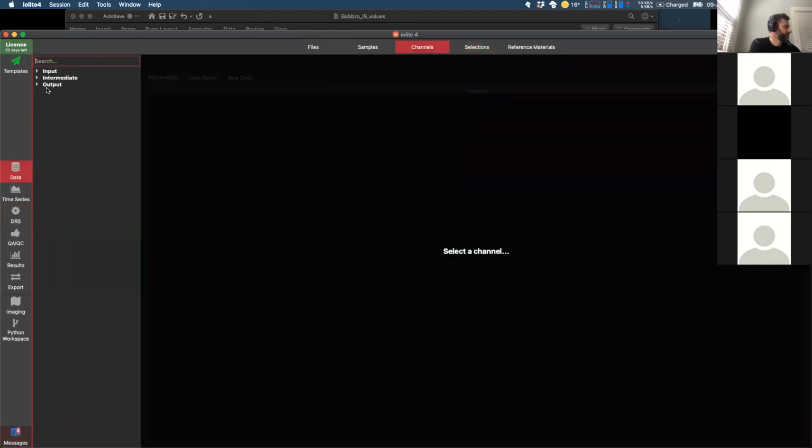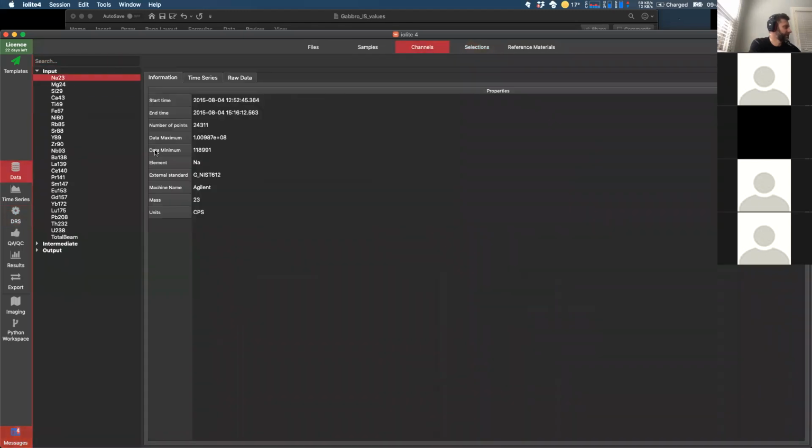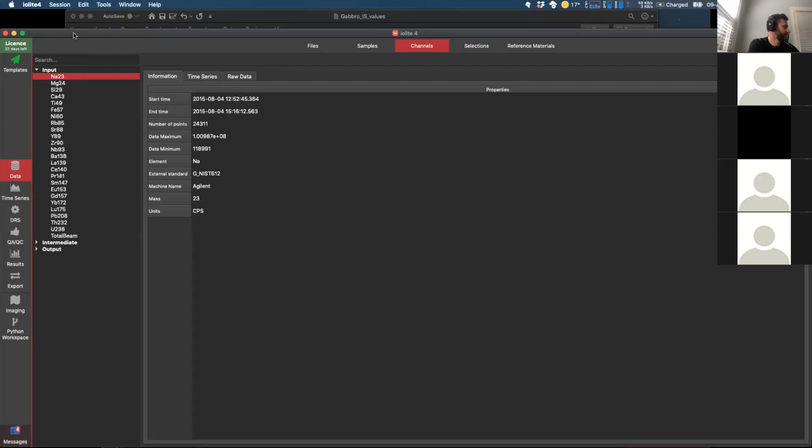So if you go to your channels and look at your input channels, at this one here, we don't have any dwell times because this was imported from a basic Agilent file. But Joe has already added a new tool that will be available in the next release in the tools menu that has a way to set your dwell times in here. So that'll be in the next release.